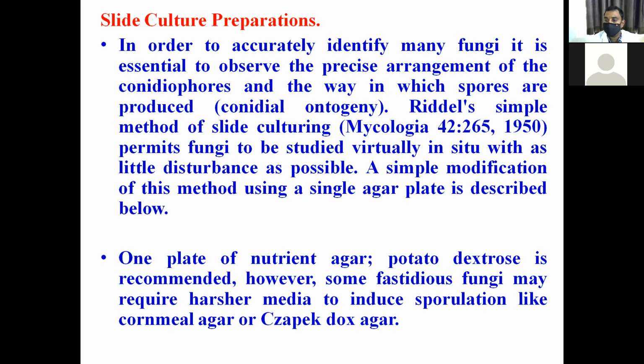That's why we do slide culture preparation, not the routinely used LCB, lactophenol cotton blue. Here what happens: the mycelia which adhere to the glass surface usually show some characters, microscopic evidence, which may be lost if teasing needles are used to separate it. It happens in routine culture with LCB, lactophenol cotton blue.